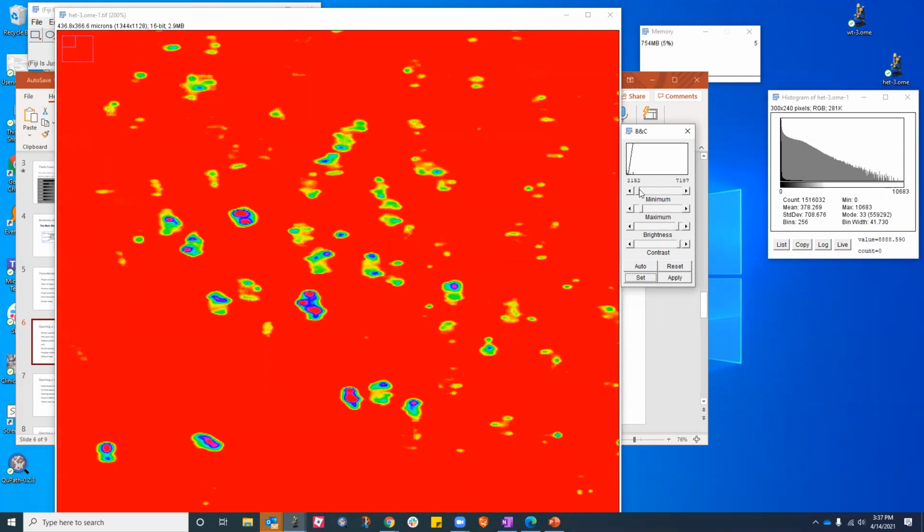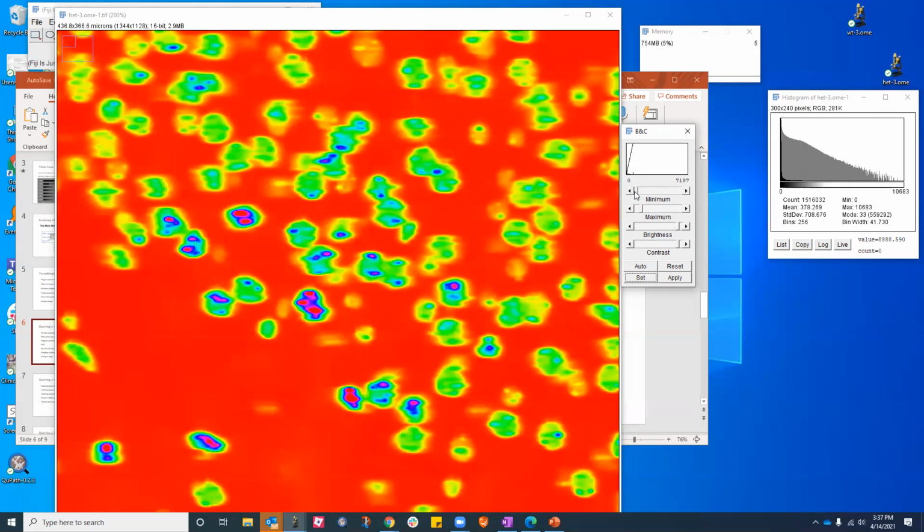So let me change the display table. This is more of a visual thing to tell people. And then if I have a heat map over here, it's very easy to know what the value is. Yeah, that makes sense.